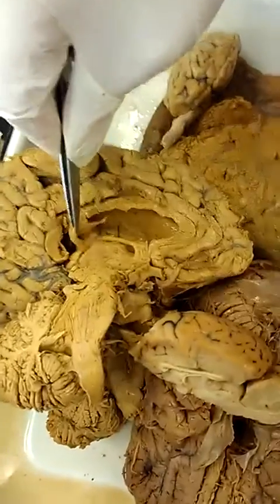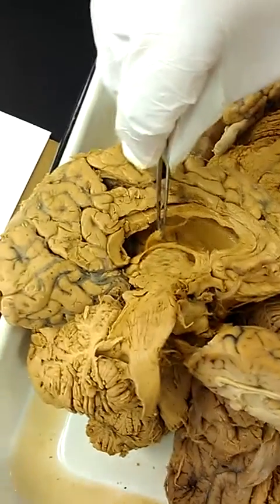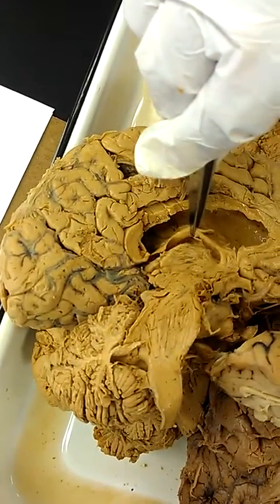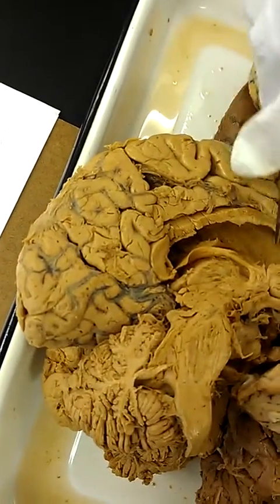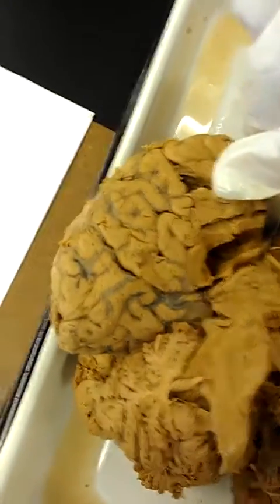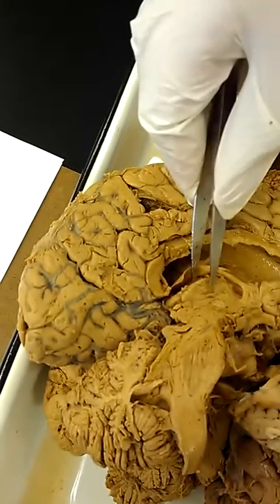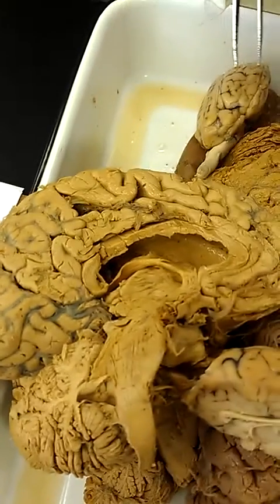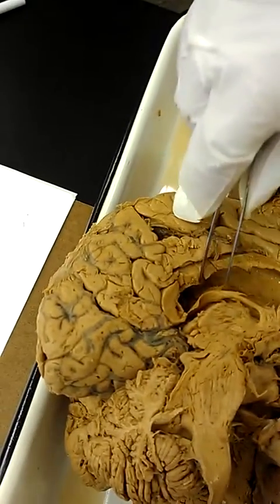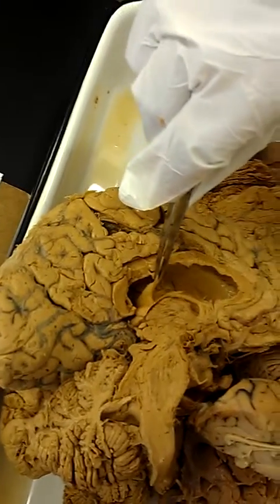Yeah. What about fornix? Also fornix. Right, it is here again. That's the bottom layer of the... It was different. It's not the same. This part, you mean? No. What? Septum pellucidum. Yeah, it's this flap that he kept pulling at.